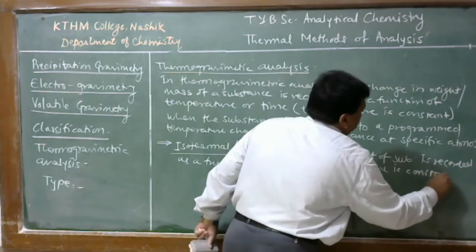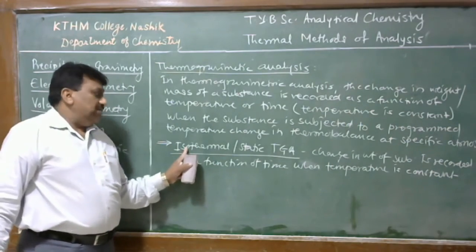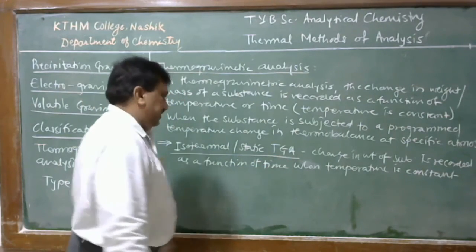This type is called isothermal or static thermogravimetric analysis.